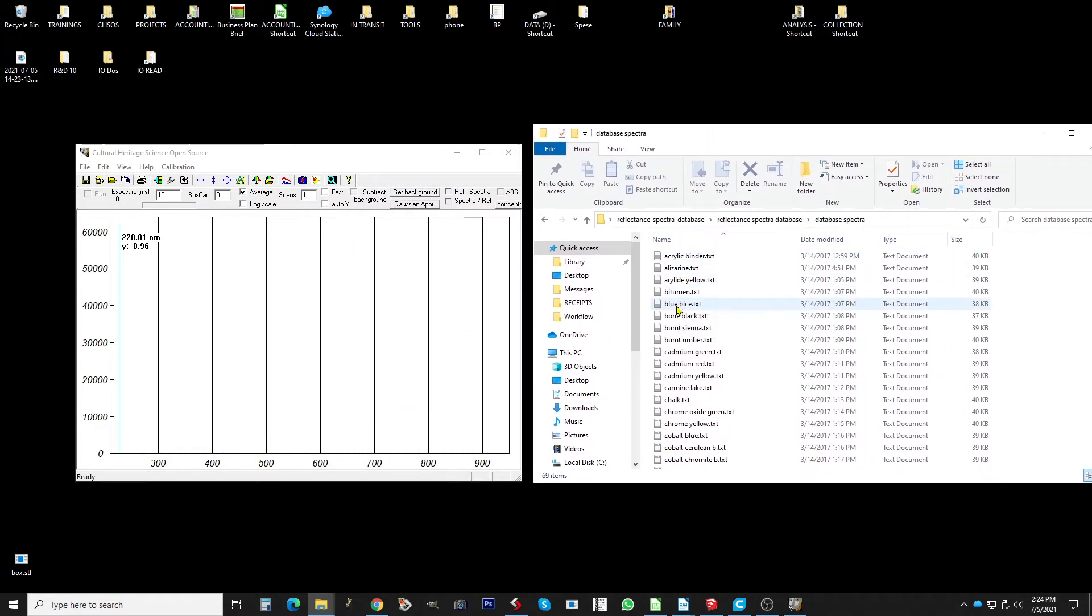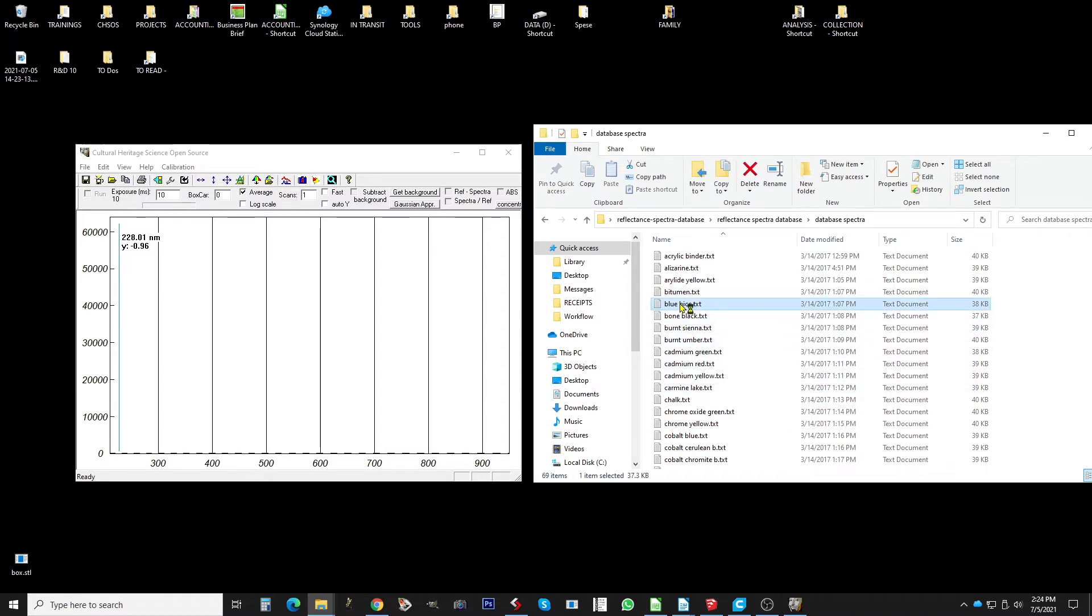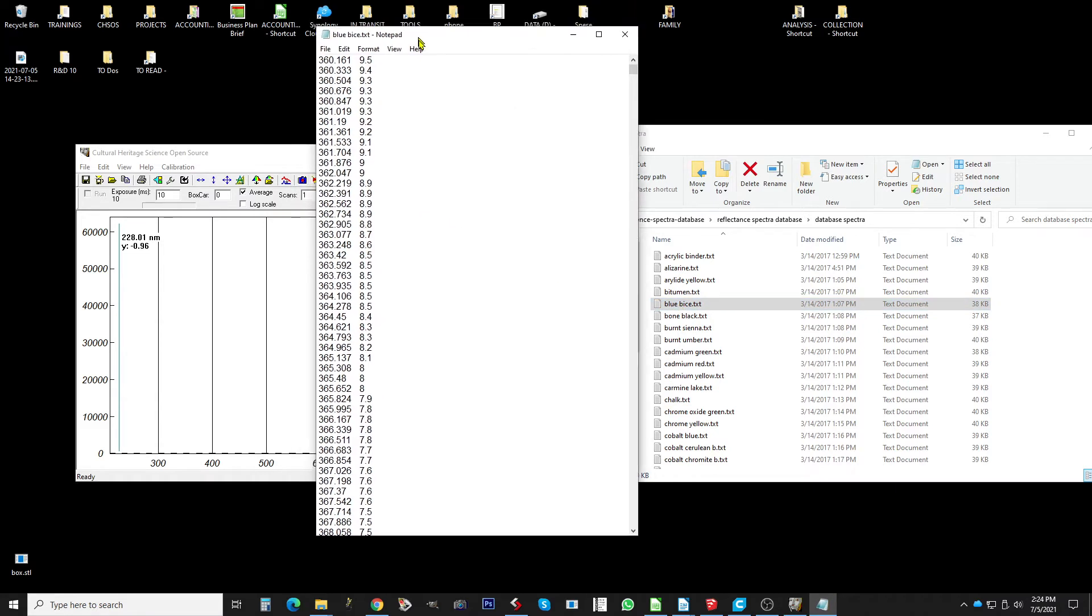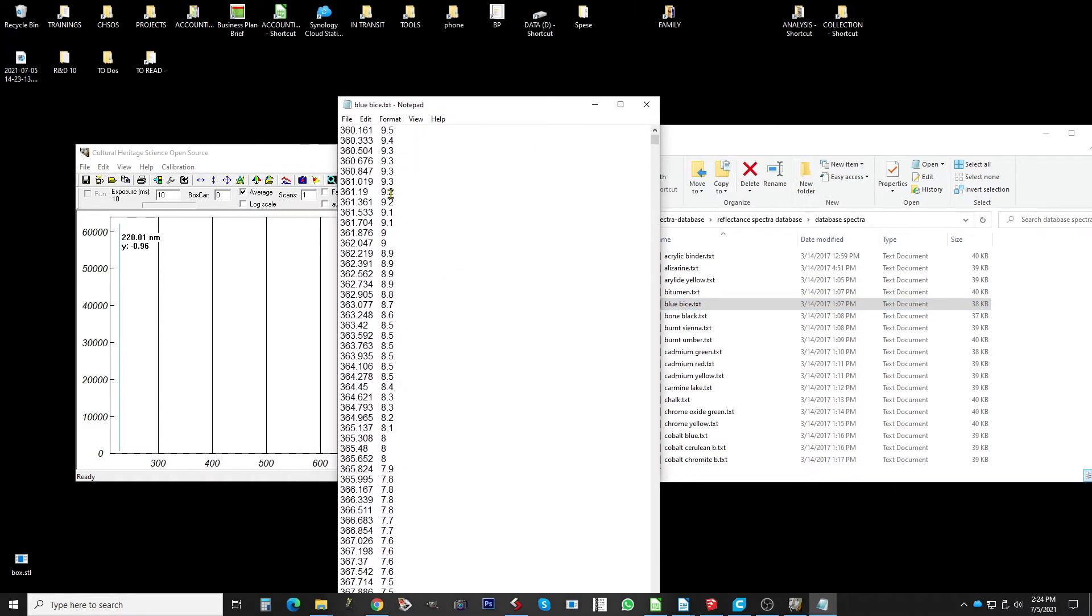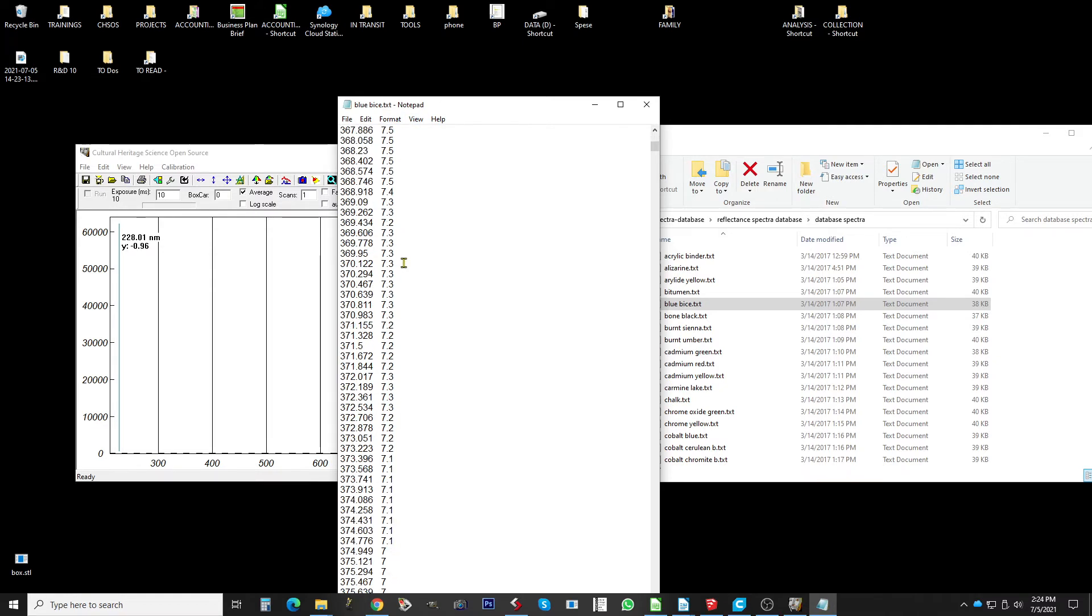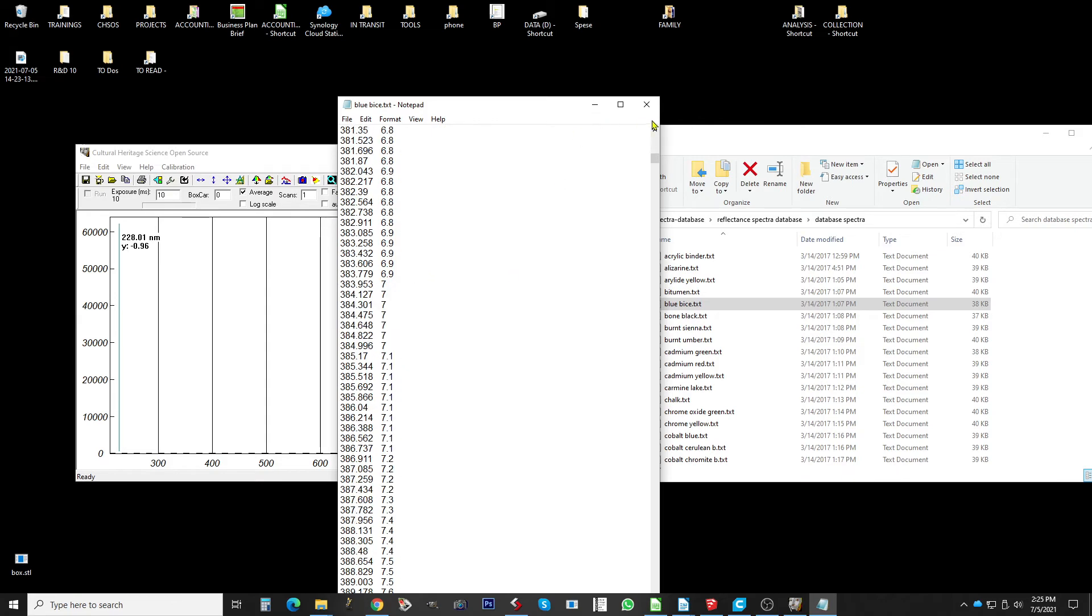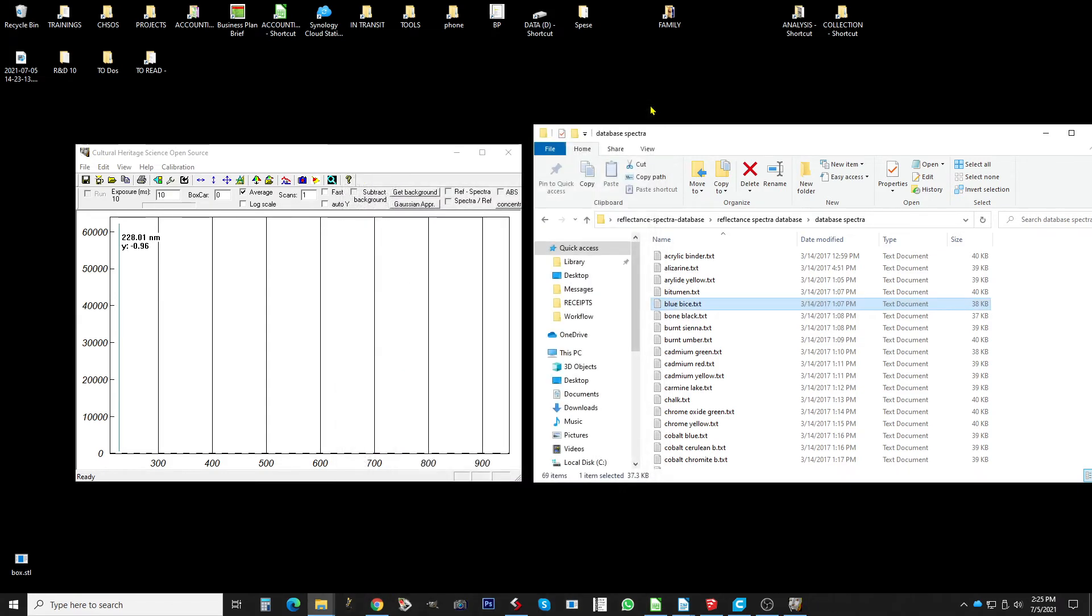The spectra are in a very open and simple format. So for example you go here in a blue bice, we double click. You see basically it's just x and y data. X is a wavelength, the y is the percentage of the reflectance. So it's a very simple format you can open with any software like even excel, it works.